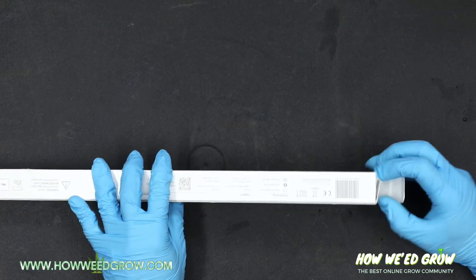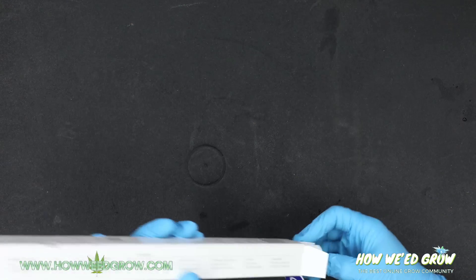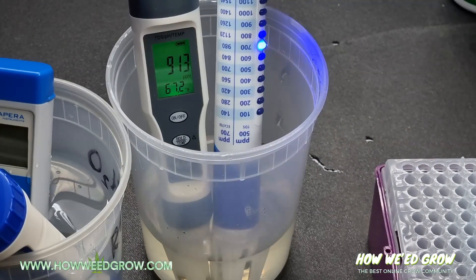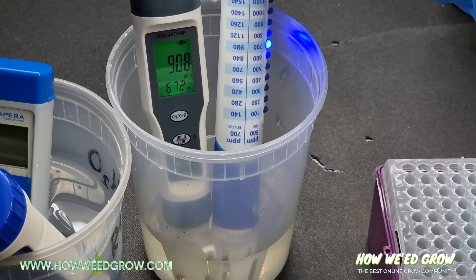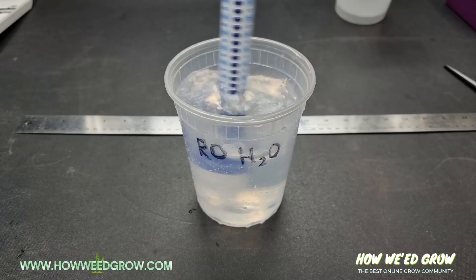So I got it, and honestly, I'm not a fan. The main thing I don't like is the level of accuracy. Everything rounds down to the nearest 100, and if it's somewhere in between, it's going to bounce back and forth — and a range of 100 isn't specific enough for me.